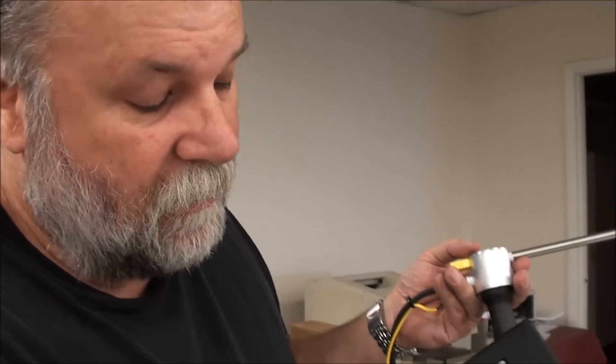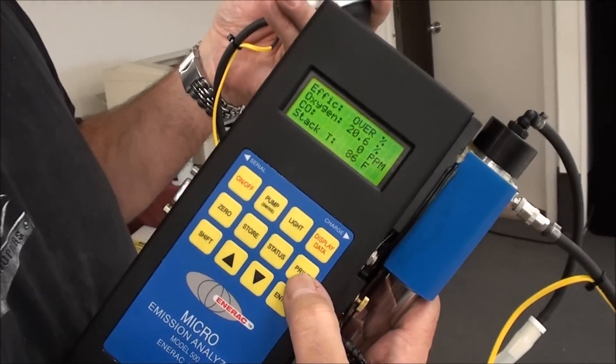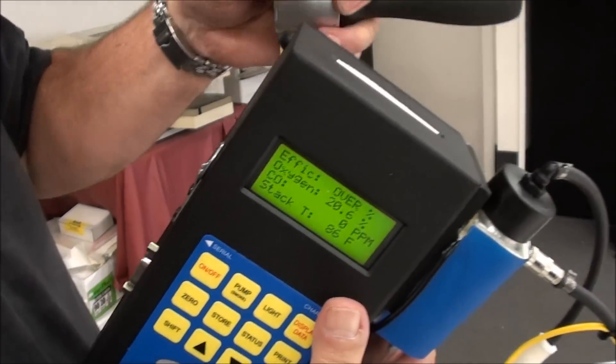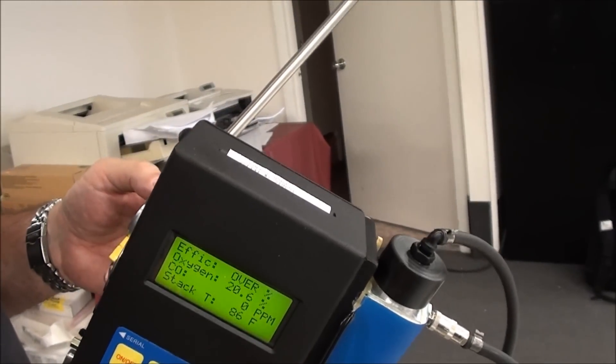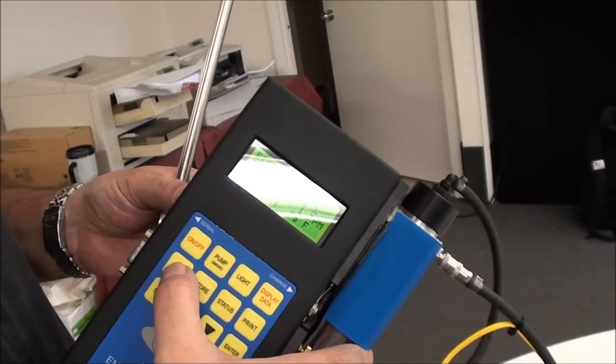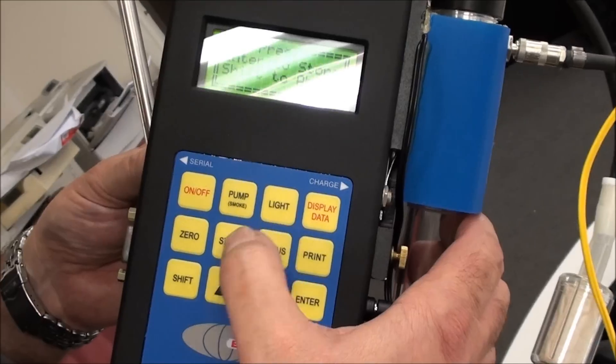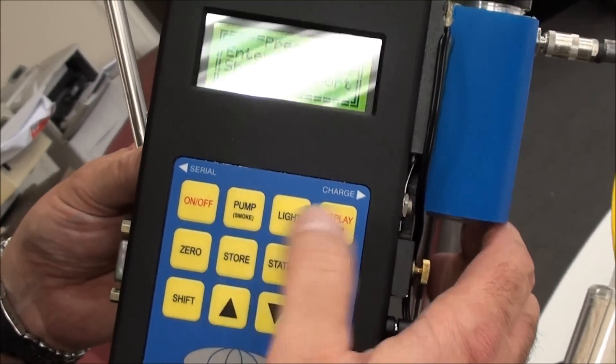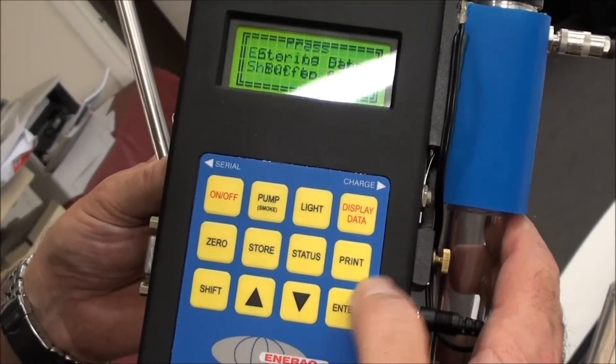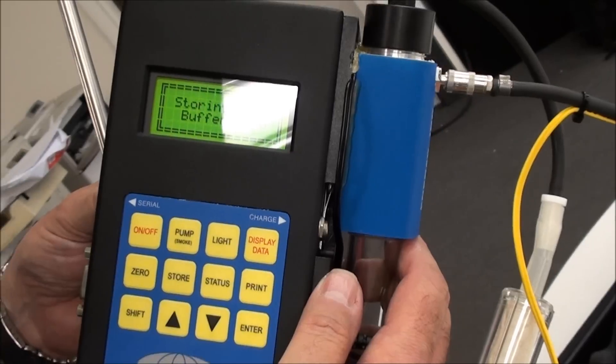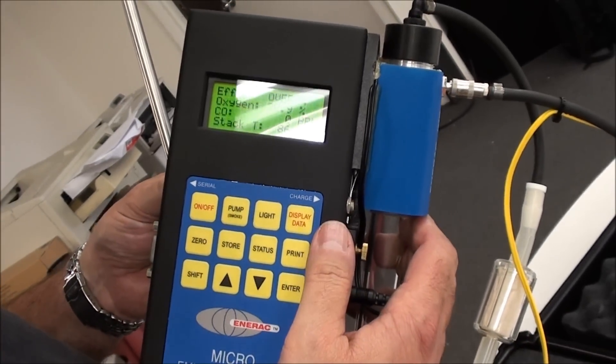You can either print it, you hit the print button, and it prints out the top. It gives you a hard copy, or you can hit the store button. It stores it internally. So once you've done that, hit enter, and it stored the data.